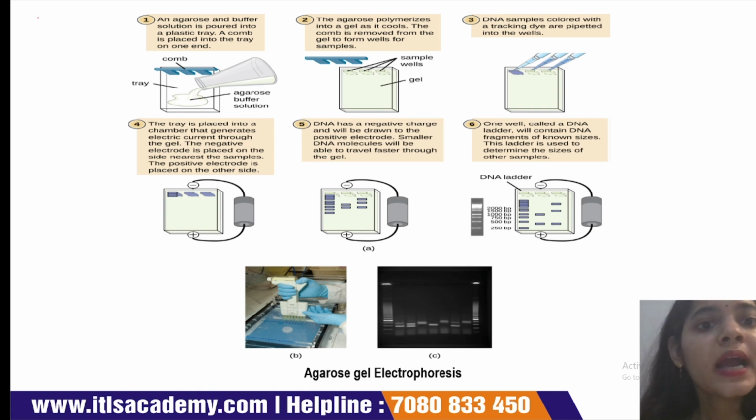After the preparation, we pour this agarose buffer solution into a plastic tray and place a comb at one end of the tray like this.